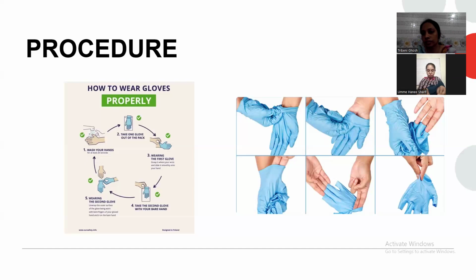I can't touch the sterile part. You already sanitized your hand with hand sanitizer, so that's why I told you that time you can skip the first part of that video. Oh, okay. Then I just need to take the gloves. Yeah, make sure you choose the right one. Should I put on the left one first or the right one? Whichever one you feel comfortable with. I think I should put on the right one first. Okay.